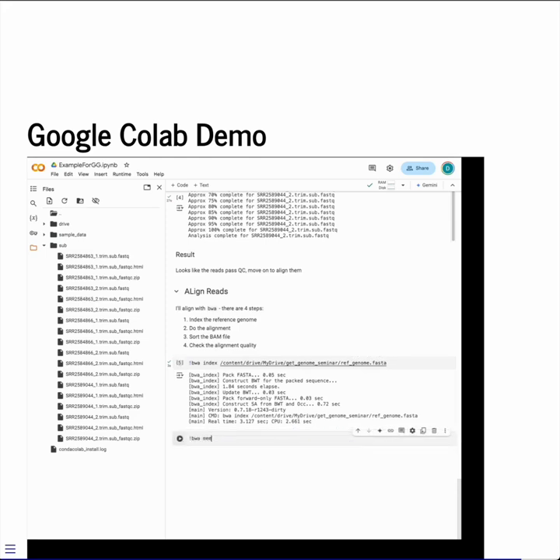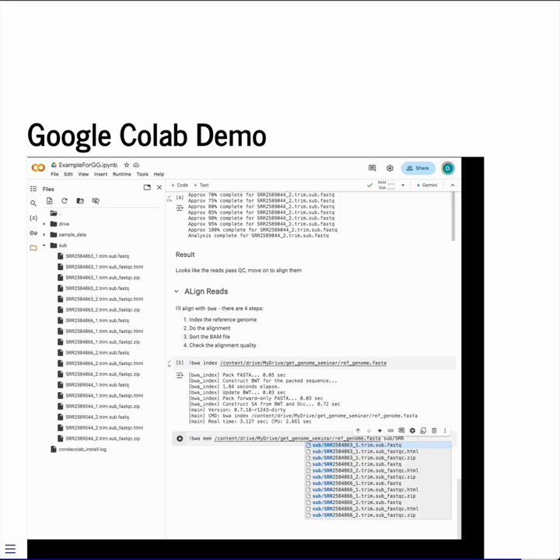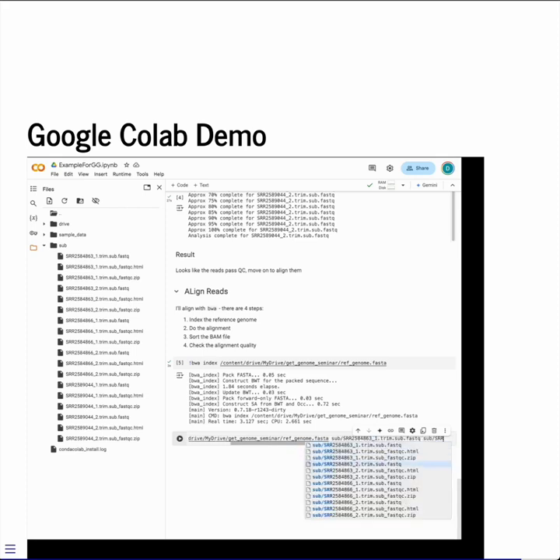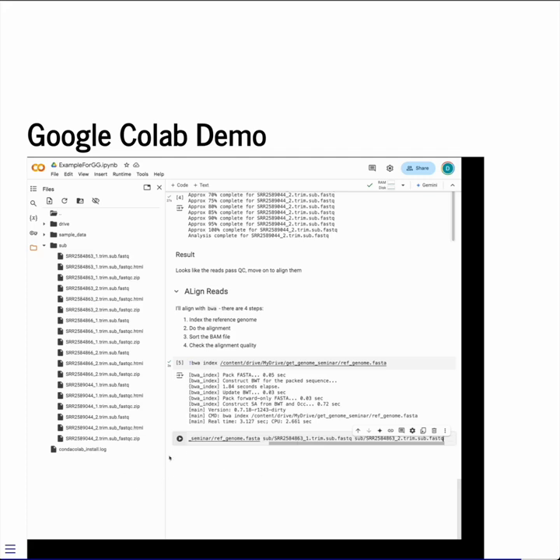And the next step is to do the BWA mem alignment. Other aligners are available if you prefer them. I use BWA mem in tutorial context mostly nowadays, just because it's fast and has a simple command line interface. There we go, we give it the reference genome and the path to the reads in the subfolder to which we extracted them. And because this is a paired end alignment, there's two sets of reads to go in. Okay, having told the computer about that, we can press run and the system messages go to the screen.